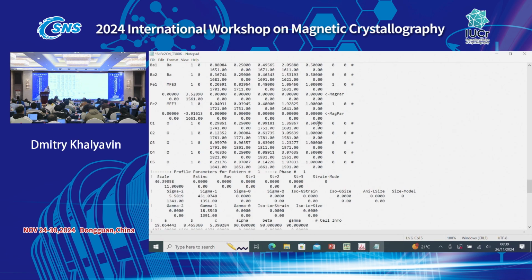Or another reason, maybe they're anisotropic, because this is a layered structure and we are trying to reproduce them with isotropic ones. So in the final refinement, you need to pay attention to this kind of thing, by the way, on the thermal parameters. If it's big like that, you can try to refine anisotropically. FullProf allows you to do that.